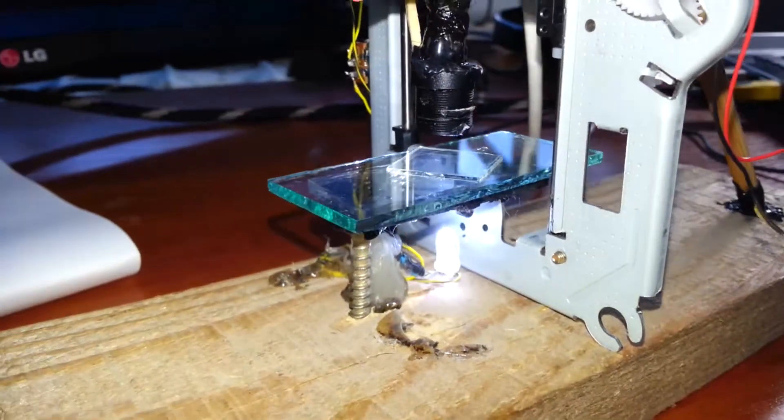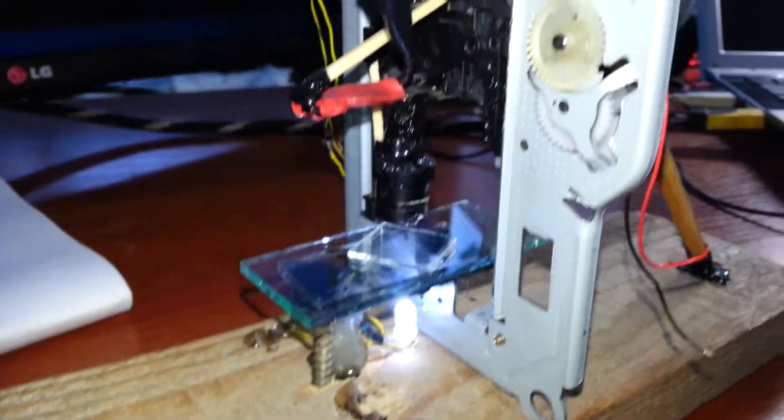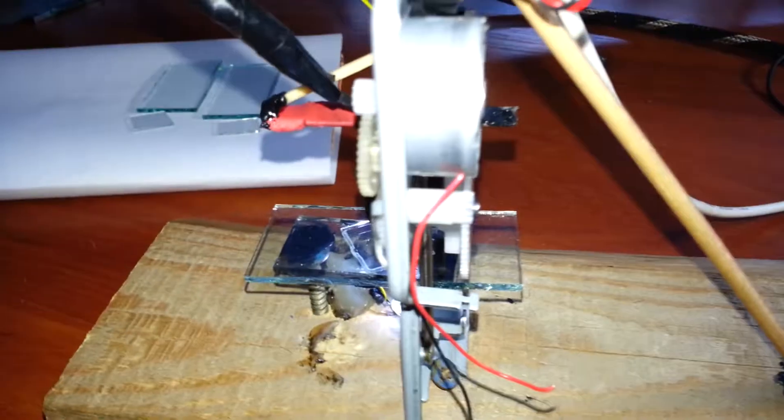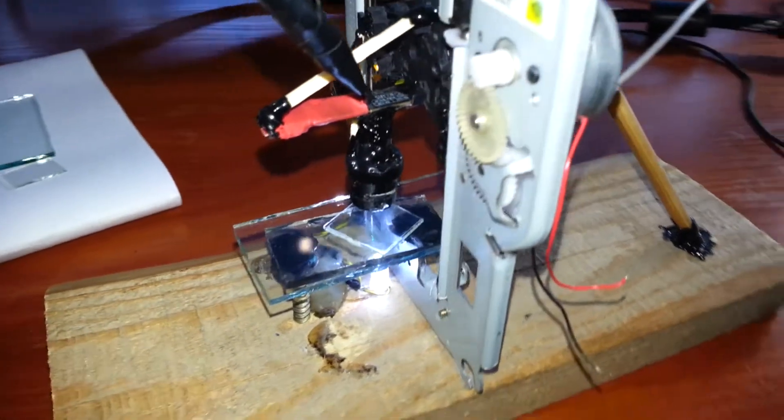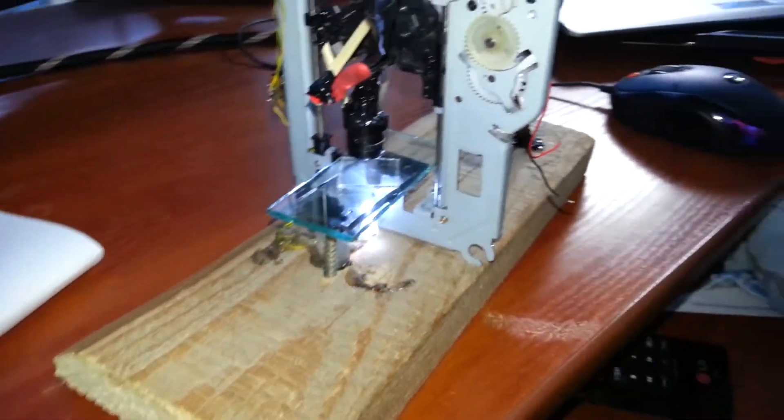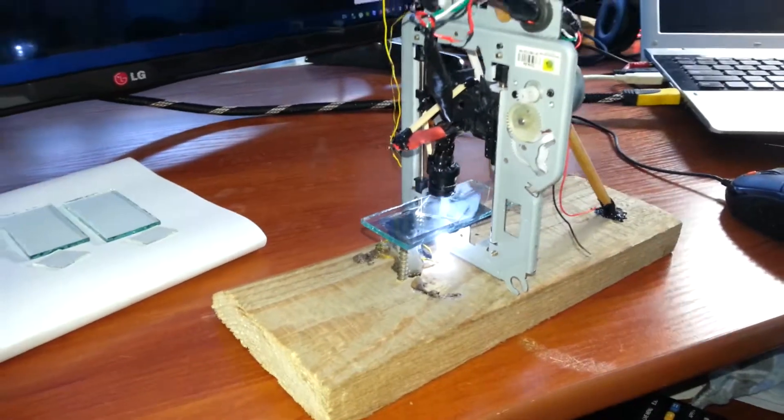Hey guys, my name is Serhii and I recently made this DIY microscope using a web camera. And in this video I'll show you how onion cells look like under the microscope.